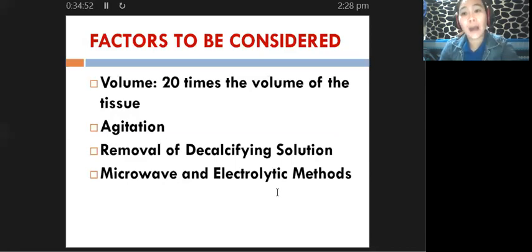While they are capable of making the process faster, you will be introducing heat to your setup. And we all know that when increasing the temperature of your setup for decalcification, you have to be very careful because an increase in temperature will also enhance the injurious or detrimental effects of decalcification.